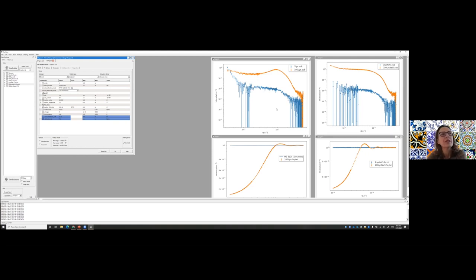So we chose this Hayter MSA structure factor, and if you had clicked on the help, it'll tell you. This is a structure factor that assumes a charged particle and assumes Coulomb types of interactions between your particles. But we were just saying that when we have a decent amount of salt in the solution, these charges might be shielded somehow by counter ions. So what would be a better structure factor? What would be your instinct?